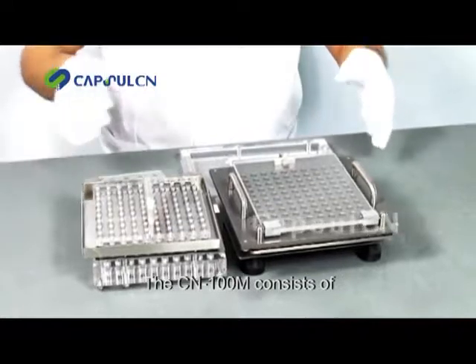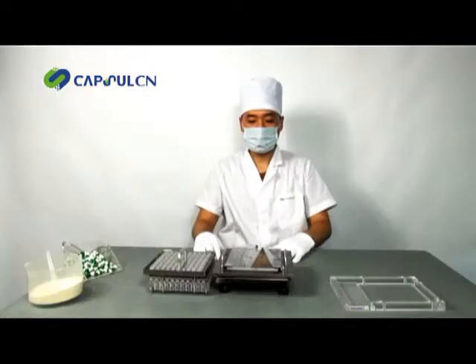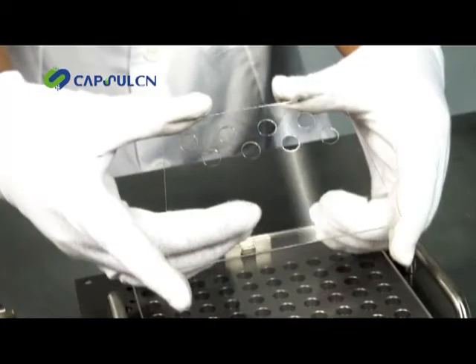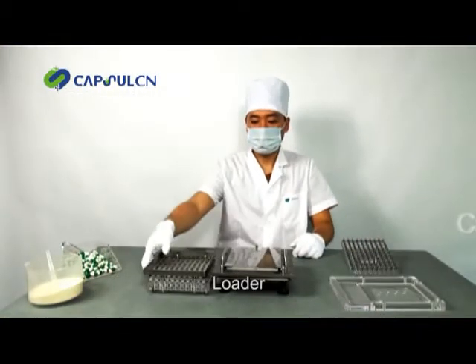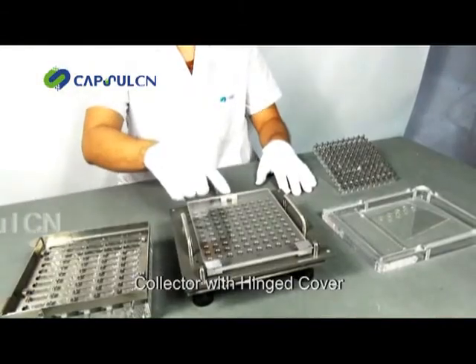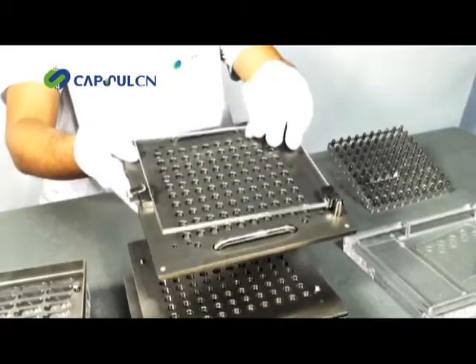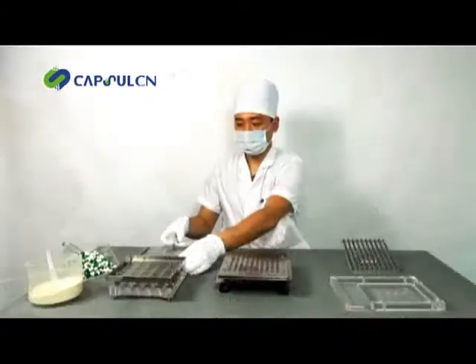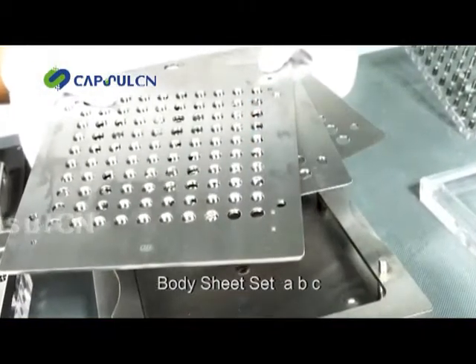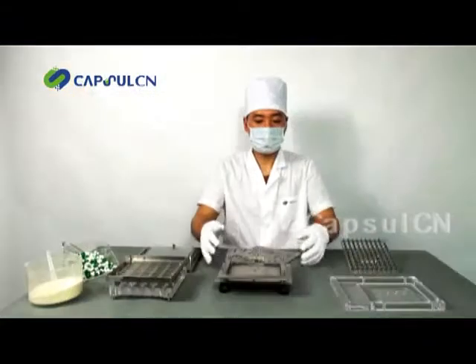The CN100M consists of one powder guard, one tamping tool, one spreader, one loader, one collector with hinged cover, one body sheet set with three parts A, B and C, and one body base.